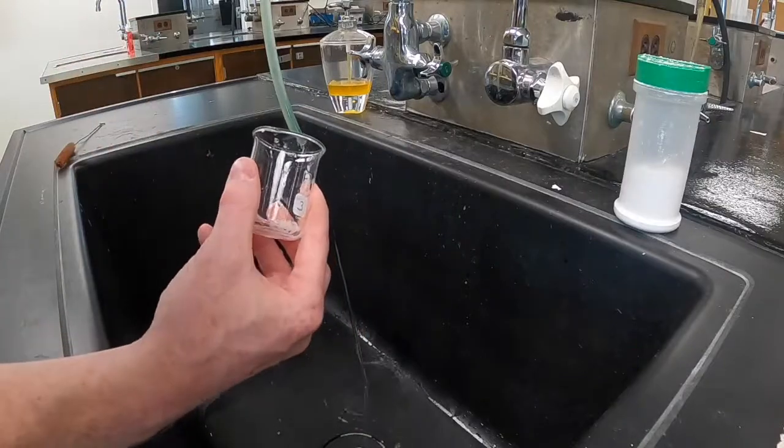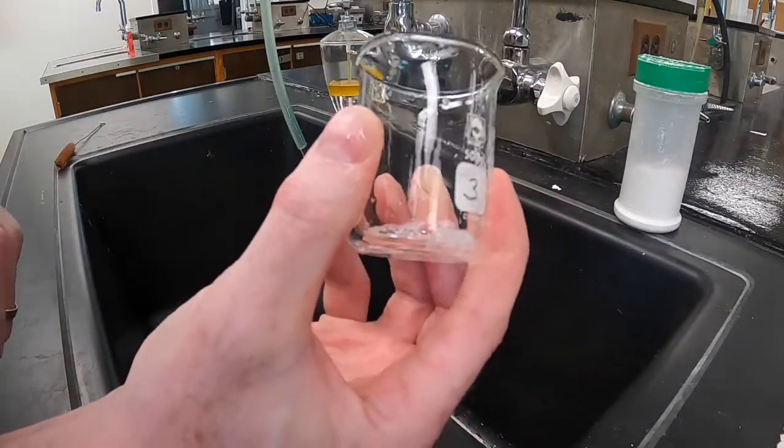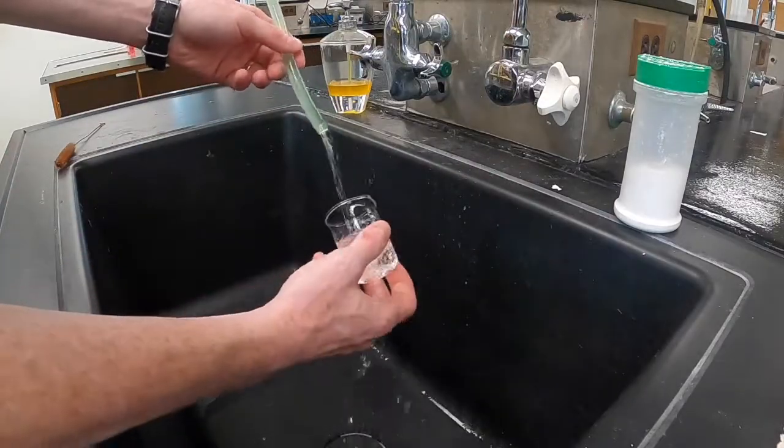When you're done scrubbing, you should dump out the soapy water. You'll be left with some soap residue in the glassware. You need to rinse that soap out before you can move on to the next step.